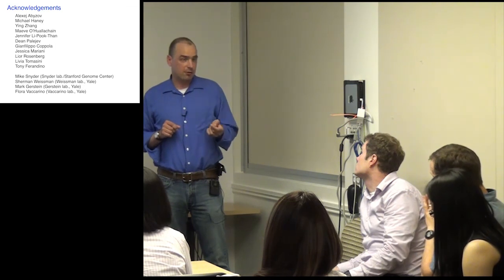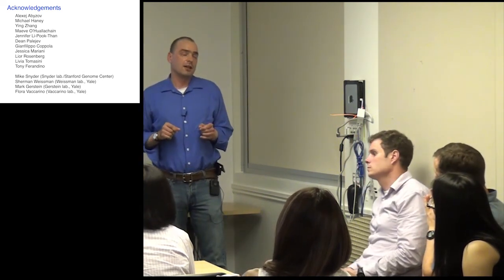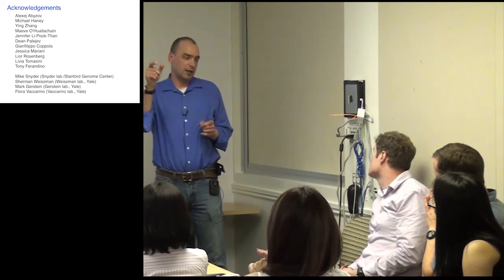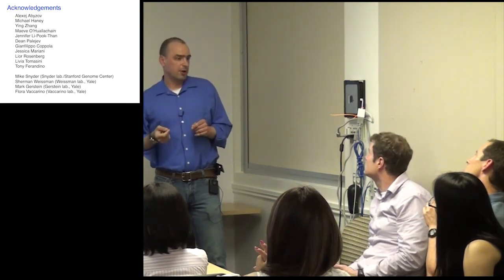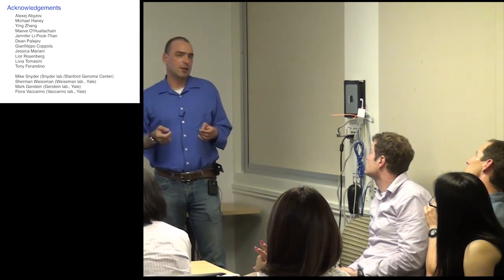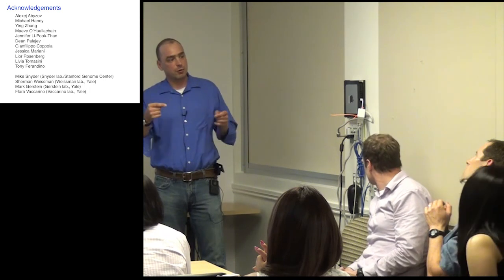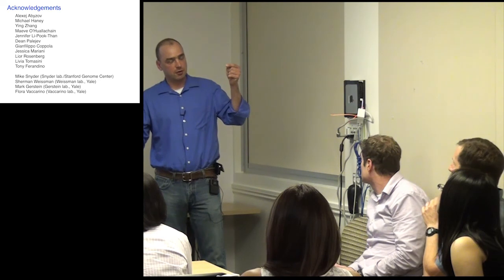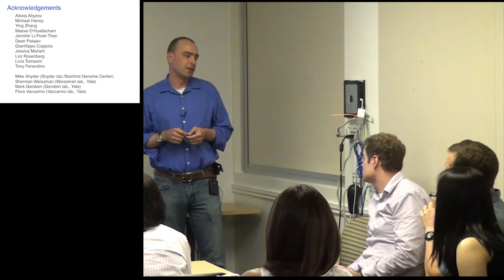If you're lucky, you have a paired-end fragment that supports the read depth signal, and then you know immediately where to place your PCR primers. In cases where you don't have that, you place one primer just inside of the predicted duplication, and on the outside you have what is called a vectorette adapter, really a universal adapter. You fragment your genomic sequence and attach the universal adapter, so you prime from one side with the universal adapter and from the other side with your specific probe, and once you get a signal, you sequence that. That works in some cases.